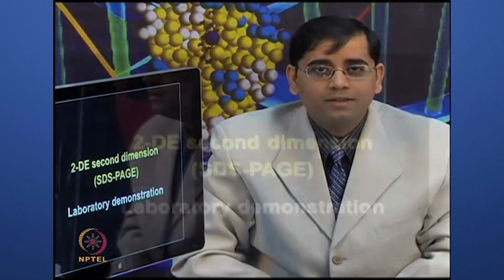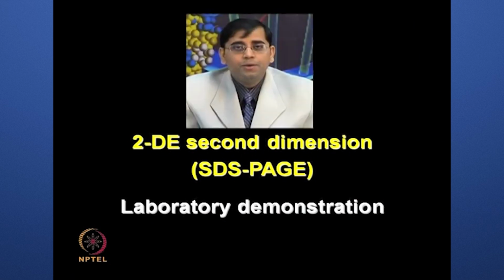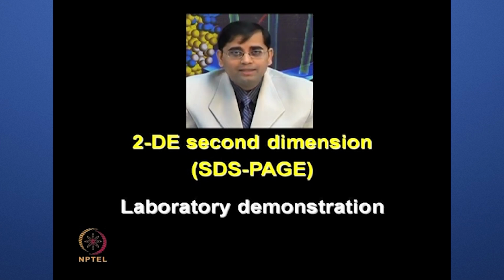After watching this animation, I hope you are able to understand how to perform native polyacrylamide electrophoresis, and these concepts can be applied for using the 2DE as well. So, now you are familiar with how you can apply both SDS page and blue native page, and you can obtain unique information about subunit composition and different types of isoforms from different proteins, and you need to apply both the techniques together. Now, you are also familiar with how to determine the molecular weight of an unknown protein.